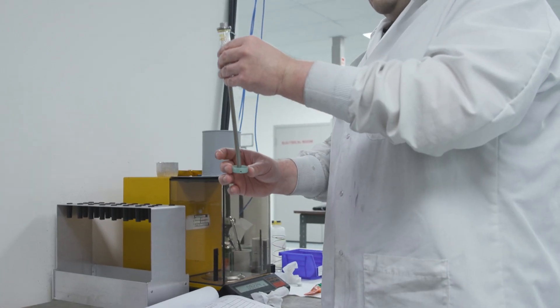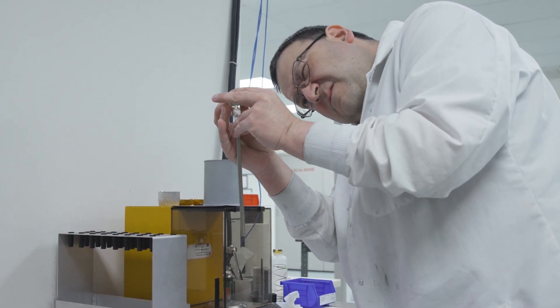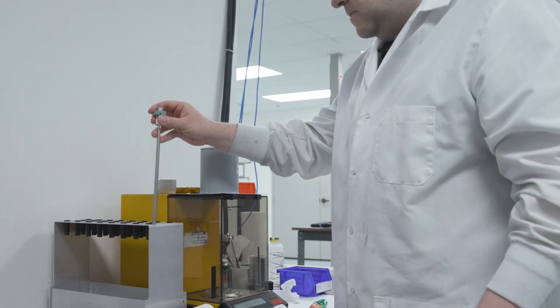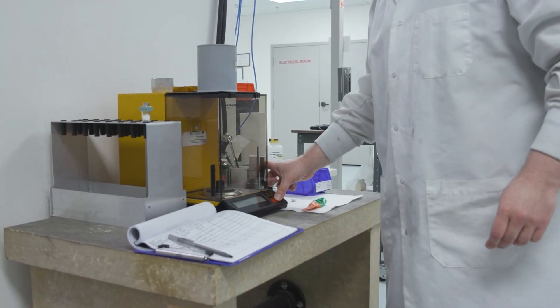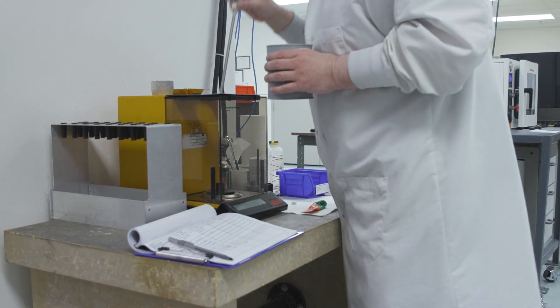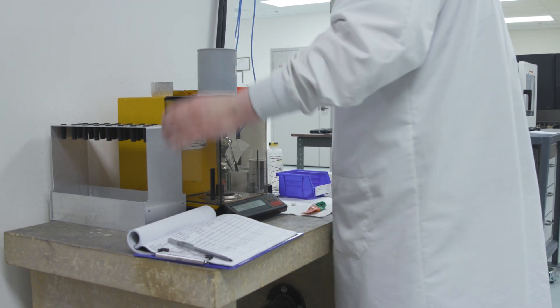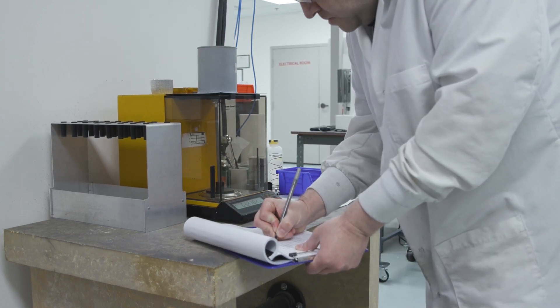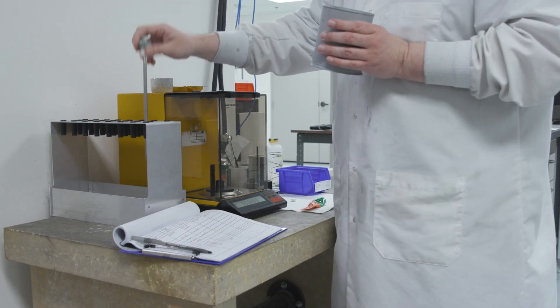He adds the sealing nut and tightens it snugly. The mass of the penetrometer is needed to determine the sample densities, and since the amount of grease used each time may vary, a new penetrometer mass is needed for each analysis. Chris will tare the penetrometer weighing support on the balance and record the mass of penetrometer plus sample, then subtract the sample mass to obtain the penetrometer mass. The sample is now ready for analysis using the Autopore.